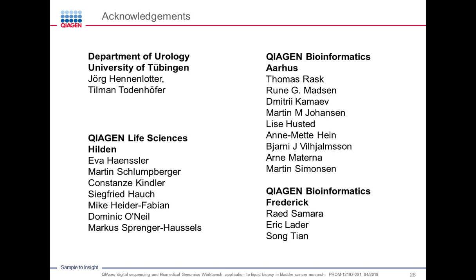But definitely, it is important that the sequencing coverage is high enough. And obviously, the nature and the characteristics of the tumor influence the detection in the plasma, because the more localized the tumor is, the more difficult it is to detect variants in the plasma, because there will be less output of the tumor into the bloodstream.